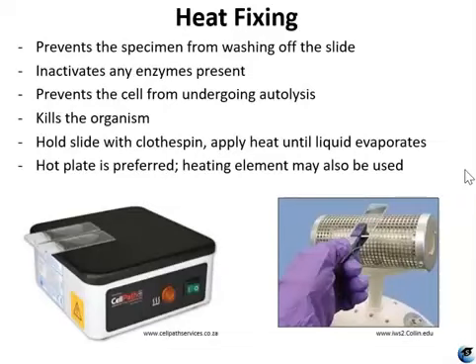Heat fixing requires holding a slide with the clothespin. The reason you use the clothespin is because the wood doesn't conduct heat as well as the glass from the slide, so that prevents you from burning your fingers. And you have to apply direct heat to the slide until the liquid on the slide evaporates. Now, we will not be heat fixing. You are not going to do the heat fixing, but you still need to know how it's done, and why it's done.